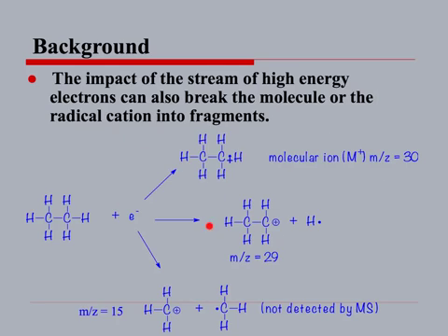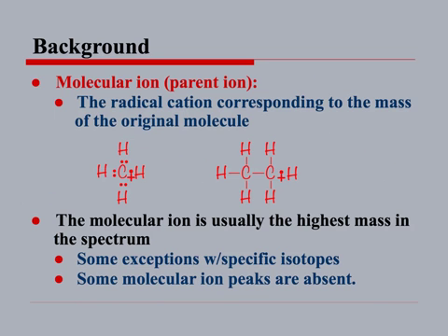These are fragments of the parent molecule. So this is the parent ion, and these are fragments from the parent molecule. Once you are expert in these techniques, looking at them again and again, you can easily see that there is 30, there is 29, there is 15. So anything containing 15, you will know it is a methyl group or methyl cation.